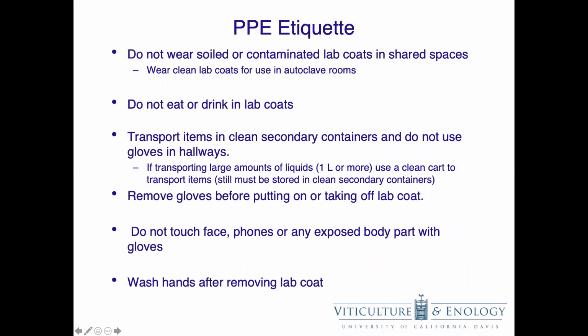I would like to discuss some PPE etiquette. Do not wear soiled or contaminated lab coats in shared spaces. This is true for both chemical and biological contamination. Wear clean lab coats for use in autoclave rooms. Do not eat or drink in your lab coats. Unfortunately, I've seen too many people in these buildings do this. I know not many of you will be working with hazardous material, but this is still something that should be abided by for the same reason that you should not eat or drink in your lab.